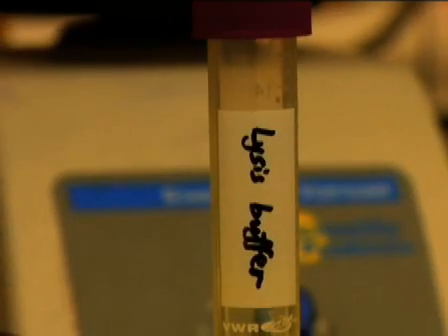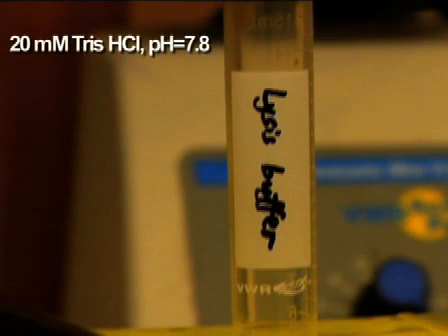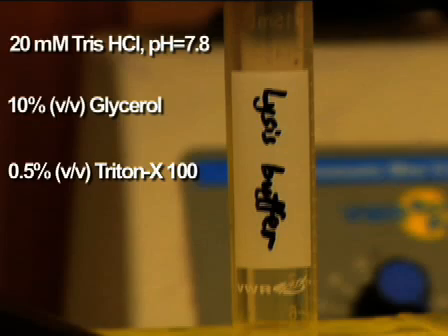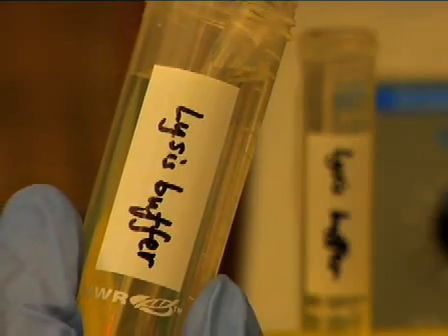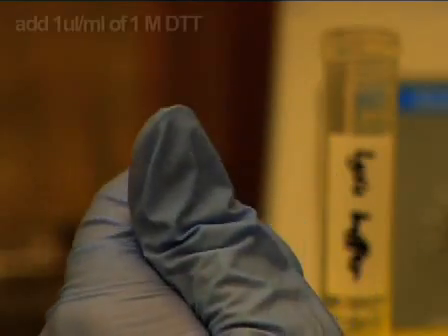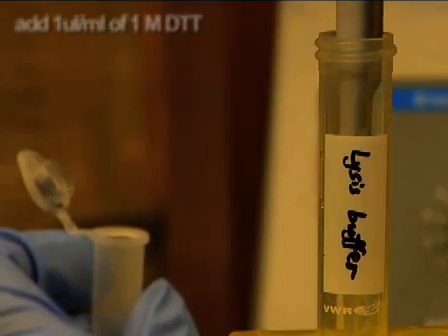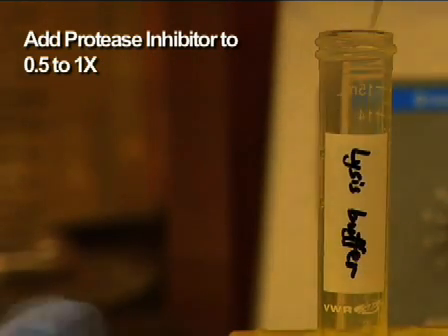To begin the luciferase assays, prepare a lysis buffer containing 20 millimolar Tris-HCl, pH 7.8, 10% volume-to-volume glycerol, and 0.5% volume-to-volume Triton X-100 prior to use. Prepare an adequate amount needed for the experiment. Then add 1 microliter per milliliter of 1 molar DTT. Do not reuse the leftover DTT solution. Then add a protease inhibitor cocktail to a final concentration of 0.5 to 1 times.